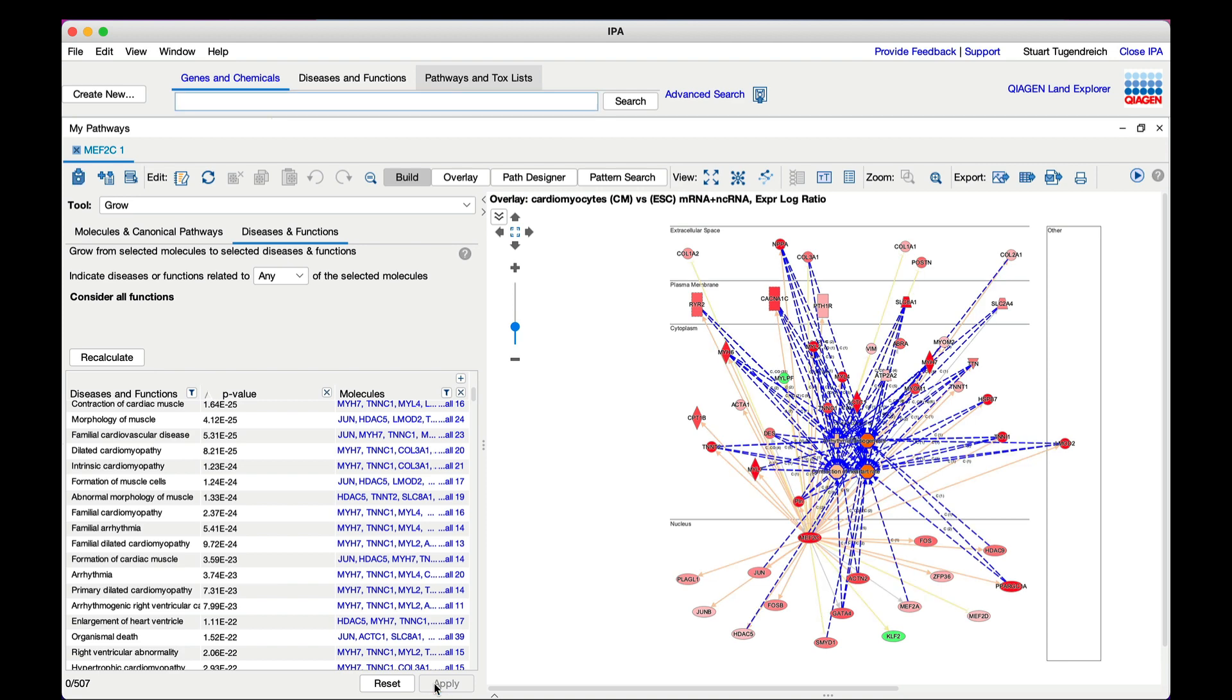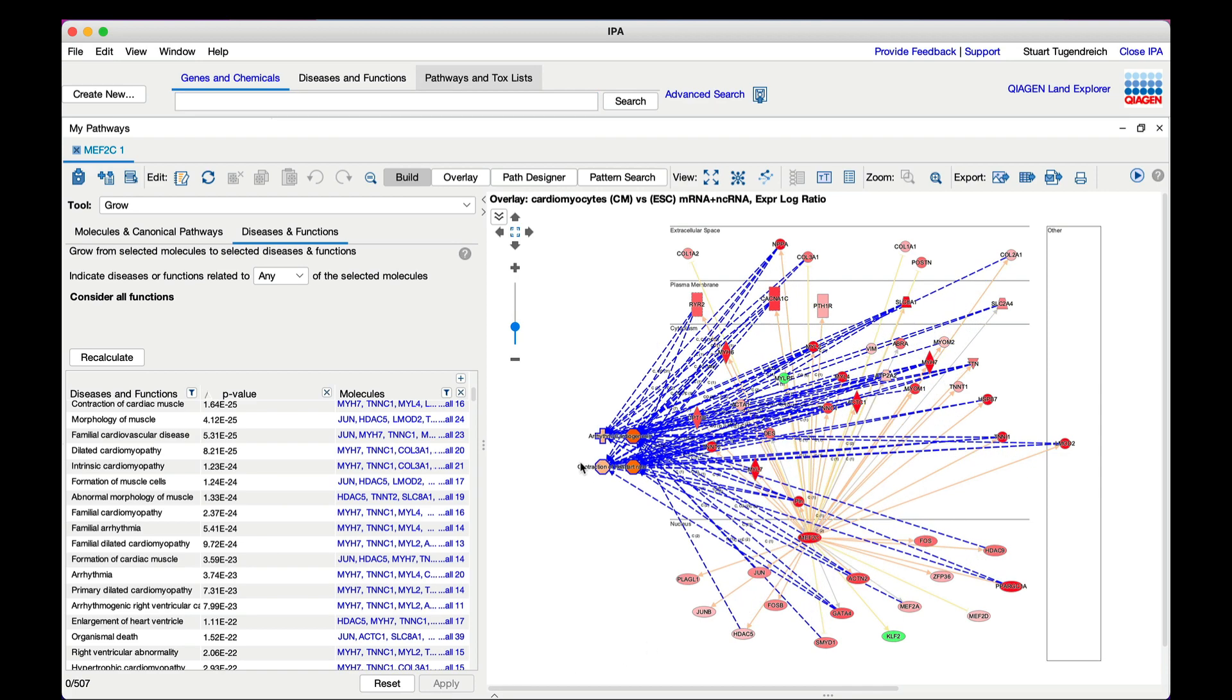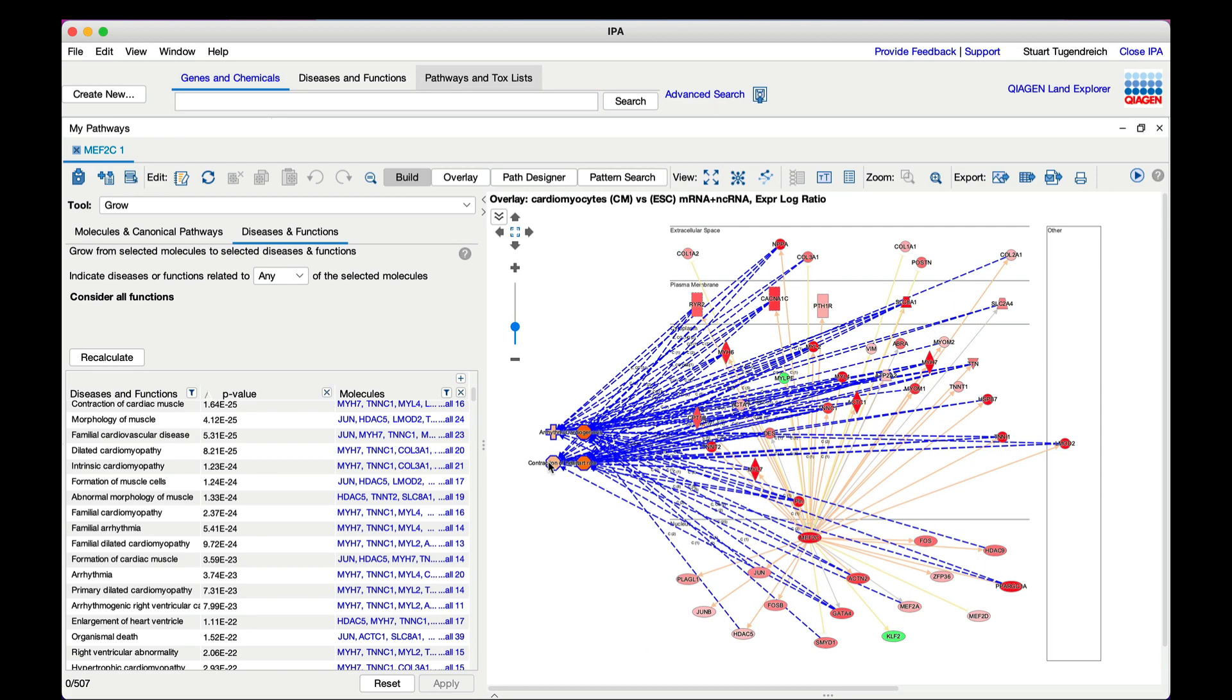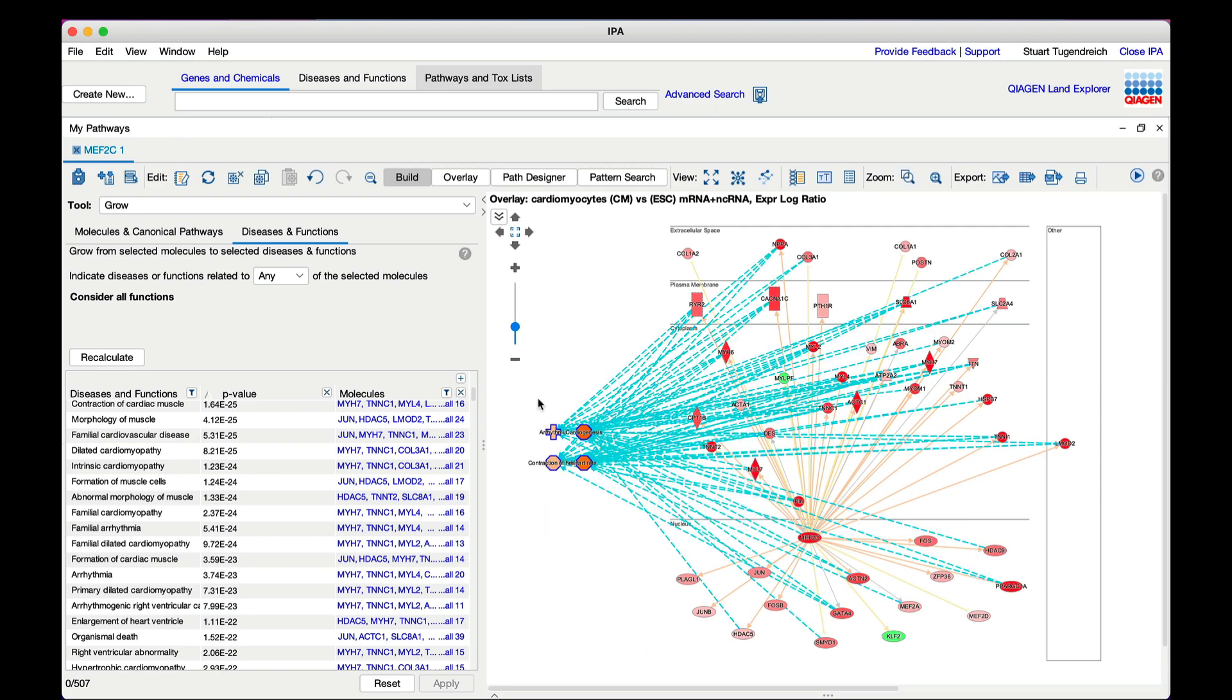IPA automatically makes a prediction that all four of the functions are likely increasing in the cardiomyocyte dataset, as indicated by their orange coloring.